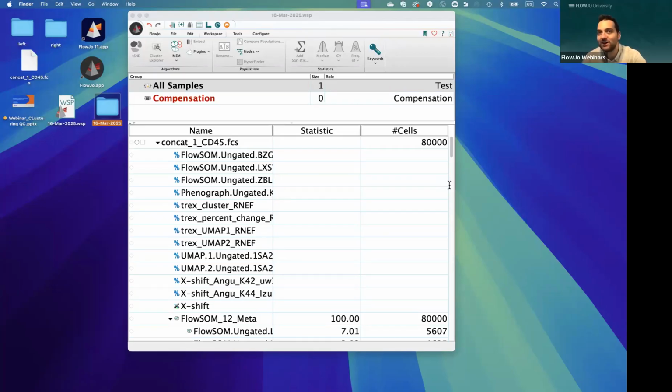You don't have the option to have 2 variables to make T-Rex run. Paloma is asking the same. Sorry, you can't really use more conditions, but you can likely rerun it with different conditions, though then it's not going to be so comparable anymore.